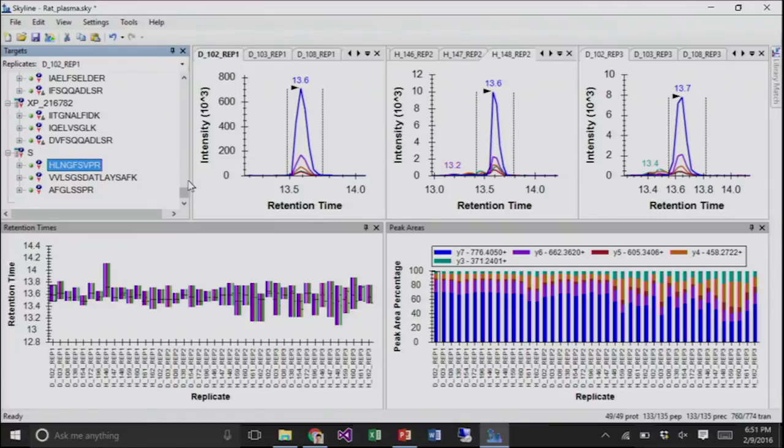Intensity drops when you change normalization. You'll see that the intensity drops a lot. Yeah, okay. So by the end, she's jumping to the punchline. We said that increased variance can be an indication of lower intensity, so we're definitely seeing some increased variance here too.